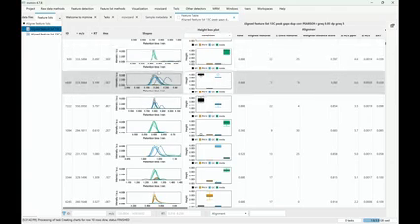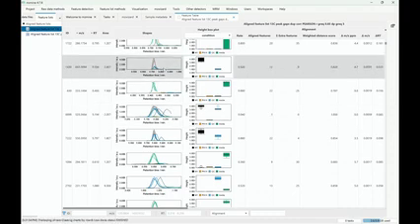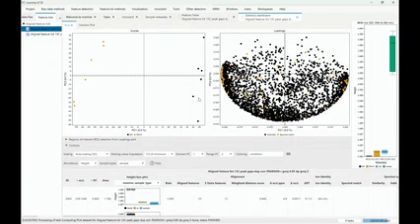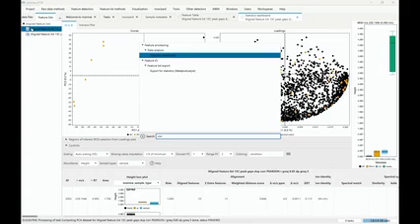But this is only some part of the statistics that we can do. So in here, you can now always say, let's say, I want to see more statistics, so I could double click on one of these charts, so one of these box plots, and it's going to open the statistics dashboard. So either you click on the box plot, or again, if you just want to search, Control F, and you search for statistics. And there's the statistics dashboard.